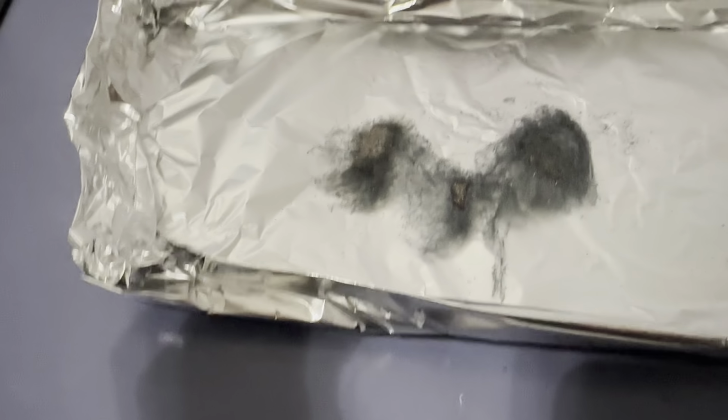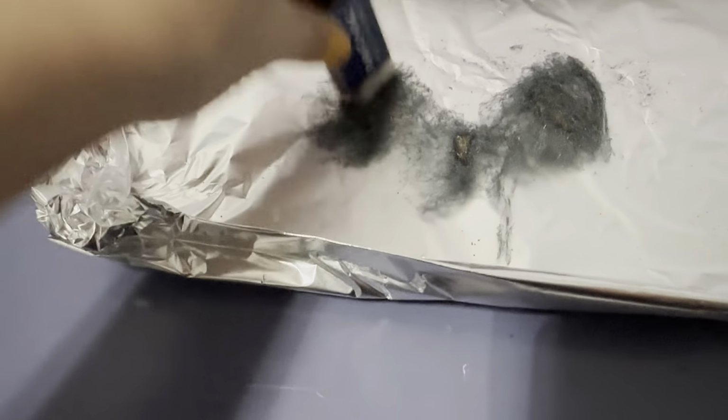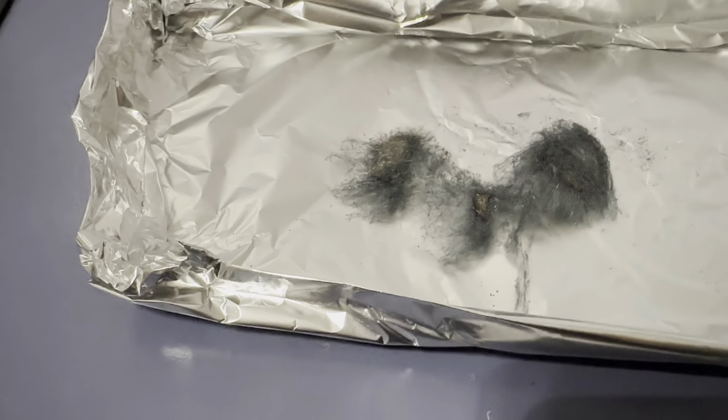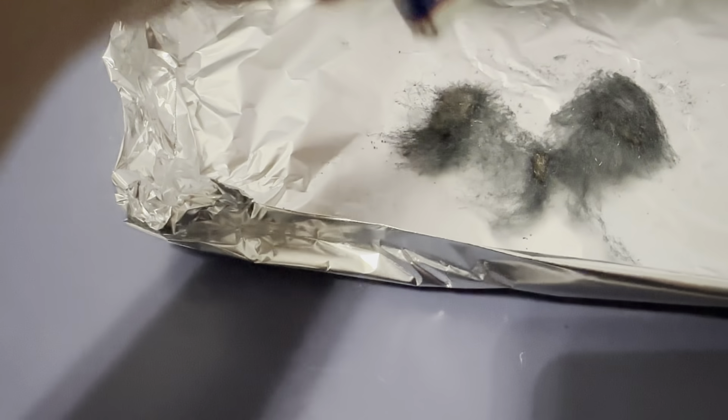Now there's not really much to this once we do the fun of getting as much as we can of our steel wool to react. Sorry, this is not aluminum, it's our steel wool. You can do this reaction a couple of different times if you have enough steel wool, or if you want to, just buy some more. You can get it at the Dollar General.